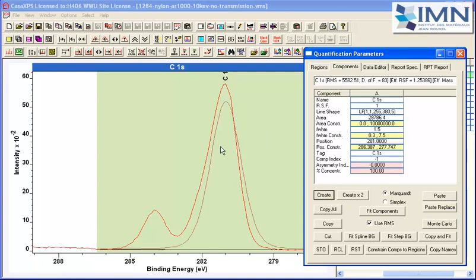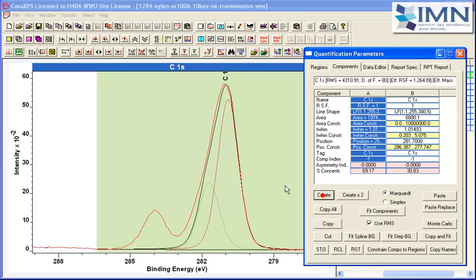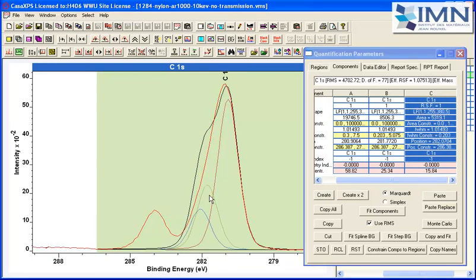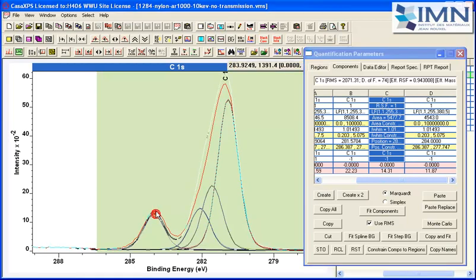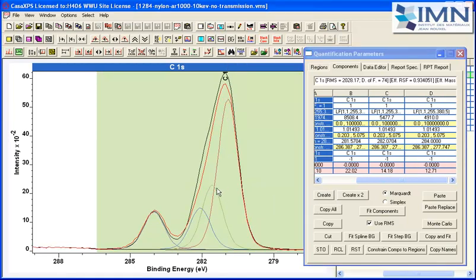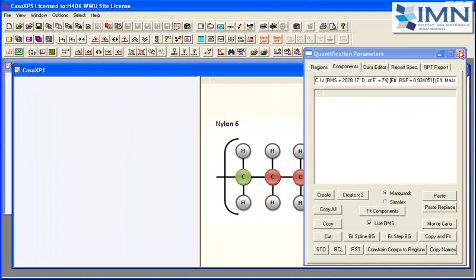So we'll create some synthetic peaks and we will position them roughly where we think these different materials ought to arrive when chemically shifted C1s is considered. So what we've got is, this is going to be a CH peak, and if we just go and have a look at our polymer again, let's see what this looks like.